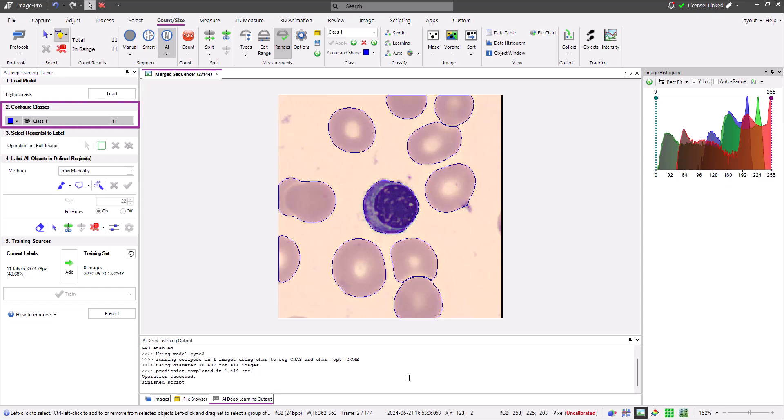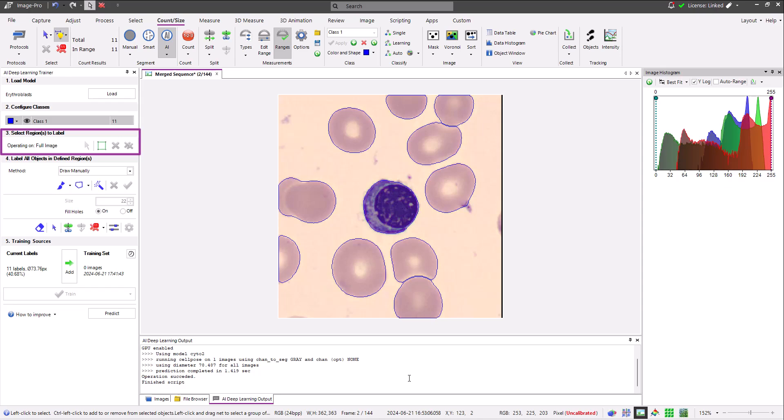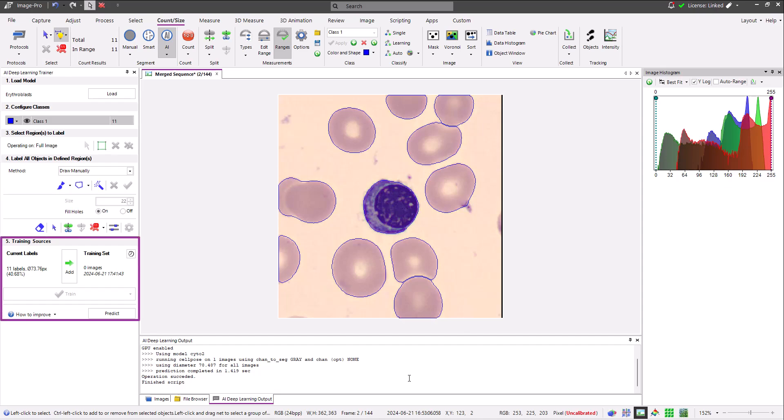Section two is used to configure the appearance and class names of your training objects. Section three contains the tools to add regions of interest to training images. This step is very important if you don't want to label all of your objects of interest. If that's the case, the objects that you label must be inside a region of interest and all of the unlabeled objects must be outside the region of interest. More on that later. Section four is where you label your objects of interest. I'll go through all of the possible methods shortly. And section five is where training data is added to your model and training is started.